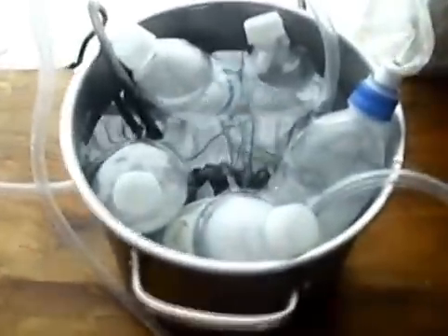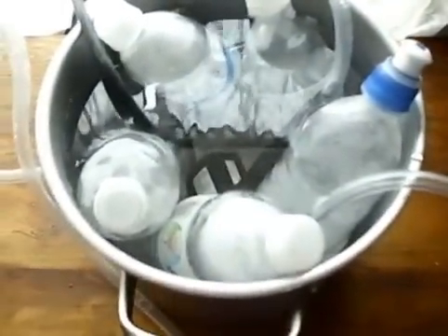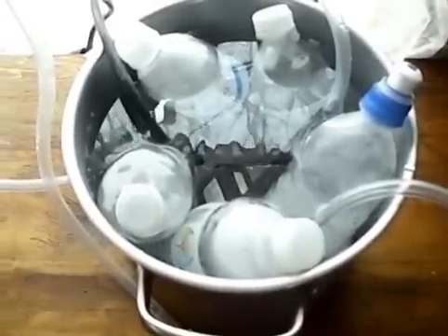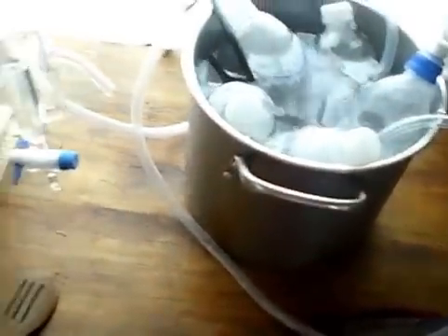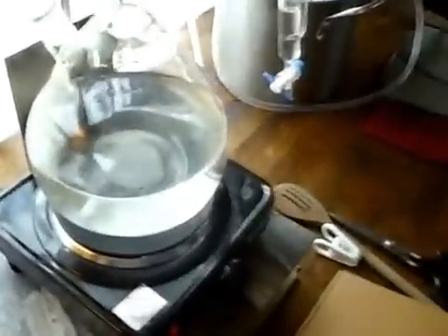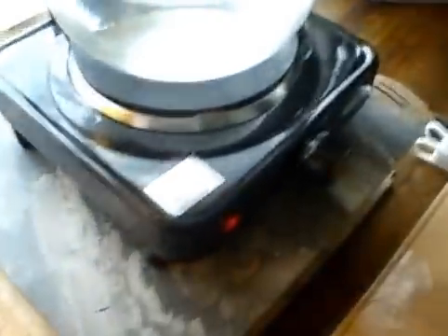I haven't turned on the condenser yet because I want to film that. I've got five bottles of ice in here and more frozen bottles of water in the fridge to keep this cool. As these melt — and they do melt very quickly — rather than hook up the condenser to the sink and waste tons of water, I'm just going to exchange the ice water bottles. That way I don't have to keep dumping ice cubes in and emptying water out. I'm now going to plug in the pump.